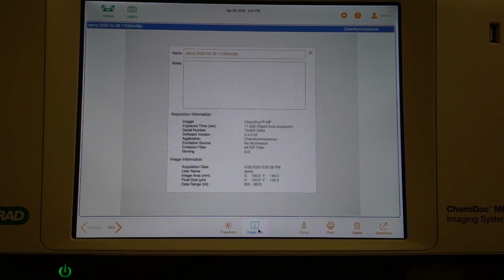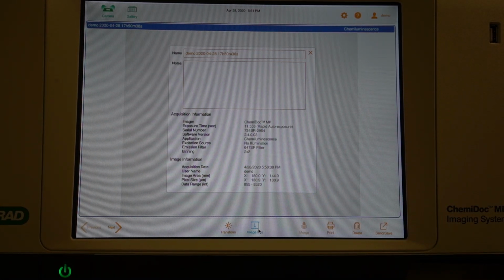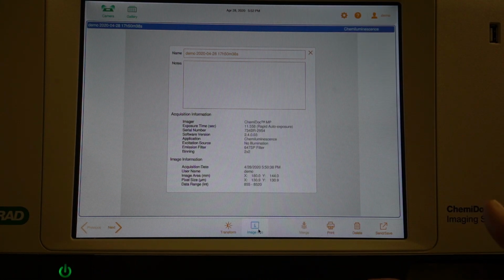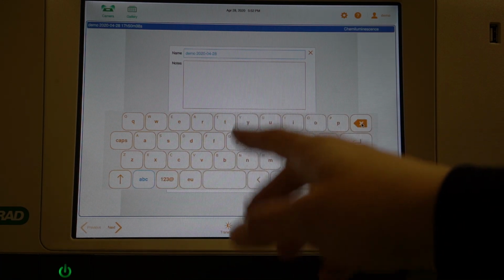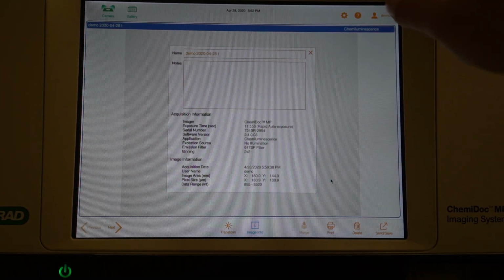There's an image info button down here, and what this does is it populates all of your metadata. So you can go back to an image and look what the exposure time was and what your settings were. This is where you can also change what the file is called. So it pops up with the keyboard, you can change the name, hit OK, and it'll change the name of the file.